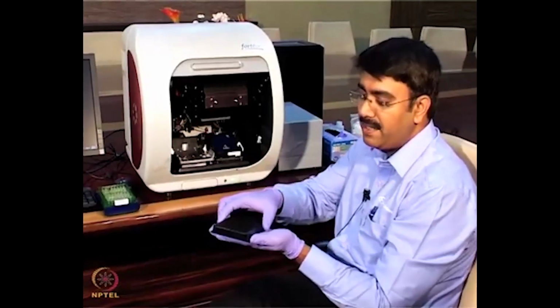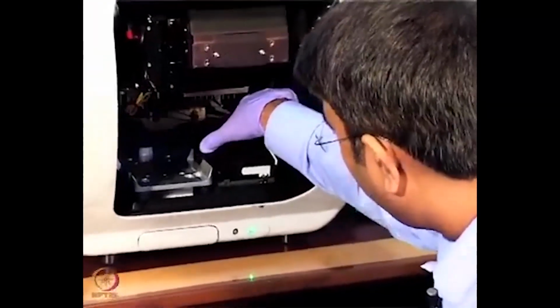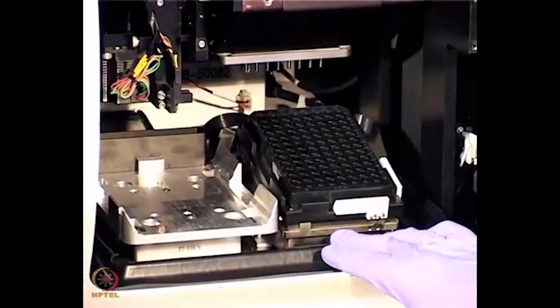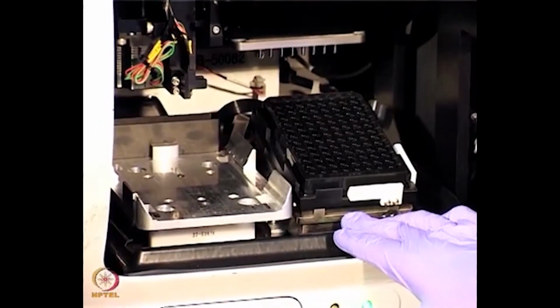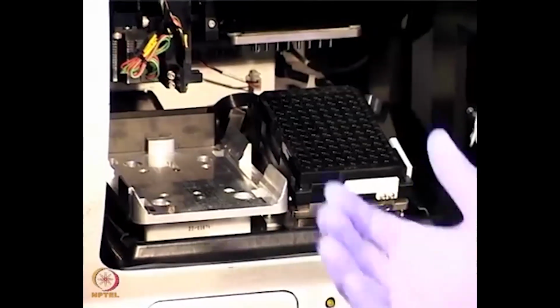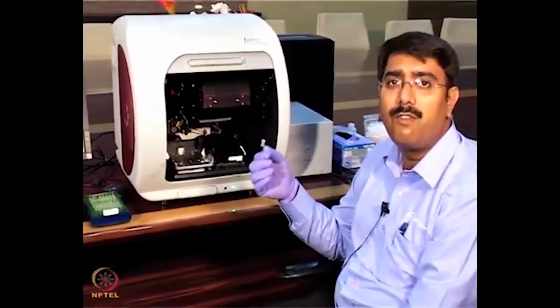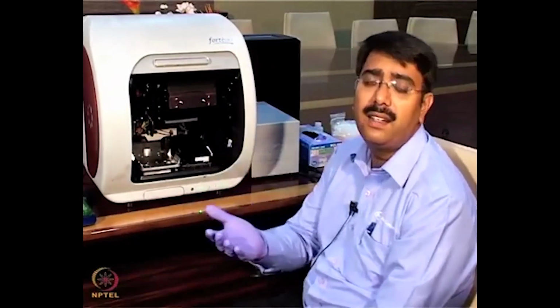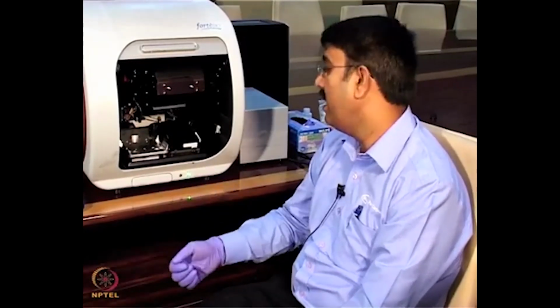This is the sample plate, a 96 well plate. I am going to place it in the sample compartment here like this. There is a click sound, and it fits firmly into the sample compartment. If you look at this sample compartment, the BLI technology works on the dip and read method. Here we do not have any microfluidics devices, so to assist binding we have a shaker. That shaker assists in the binding. The shaker works from 150 rpm to 1500 rpm, and the sample plate also has temperature control. We can work from ambient room temperature, 23 plus or minus 4 degrees, to 40 degrees centigrade.